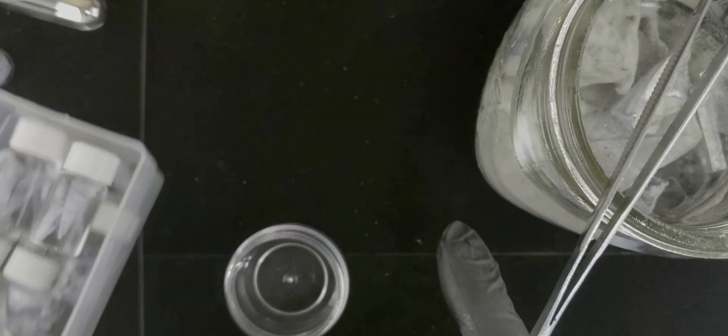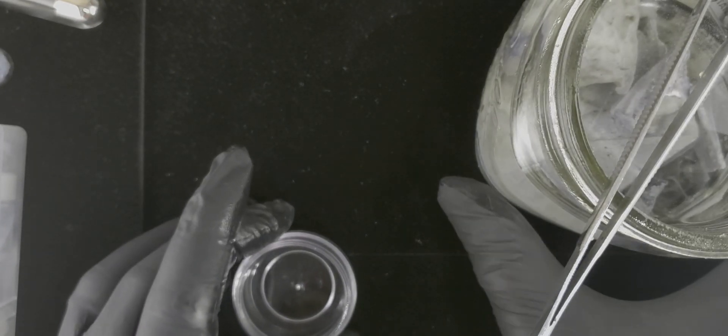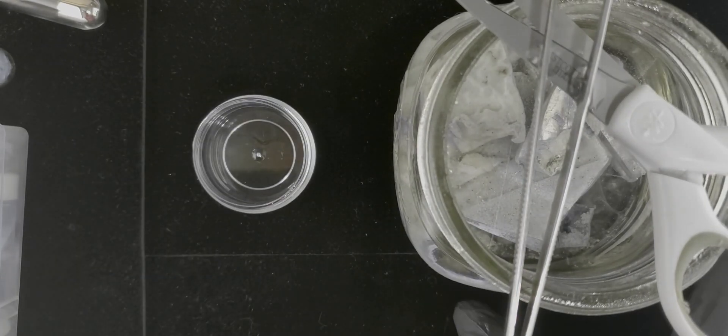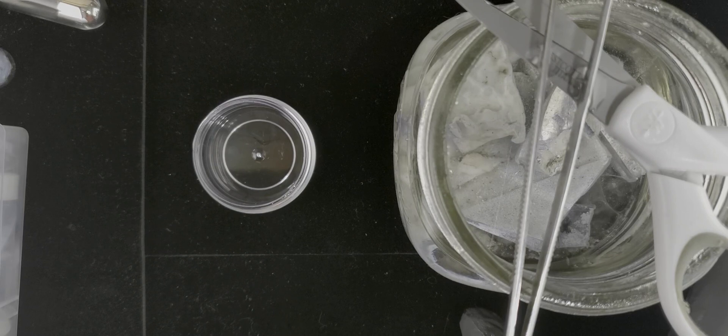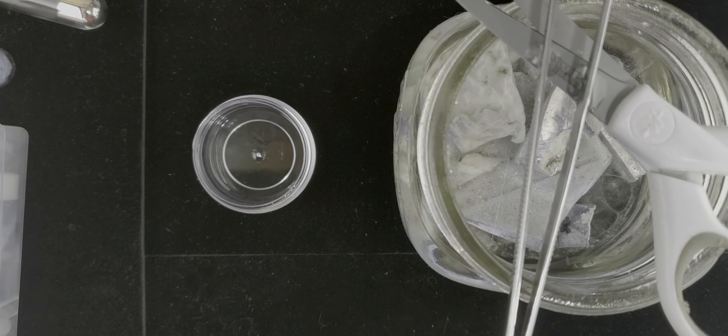So that's potassium. And this is a metal that burns when you plop it in water. And you'll get a very colorful explosion, really, because it doesn't just catch on fire. It looks pretty violent.